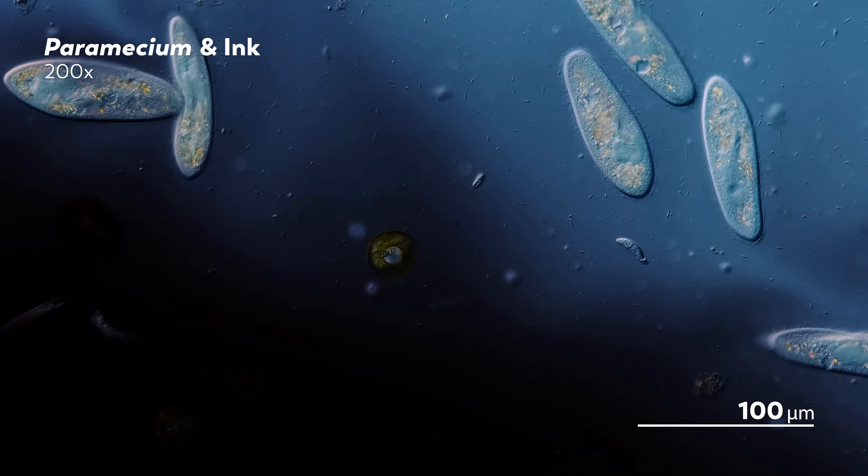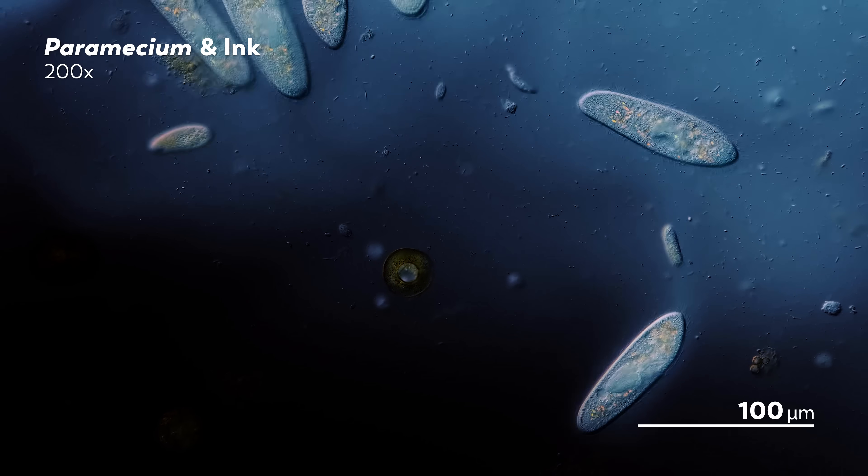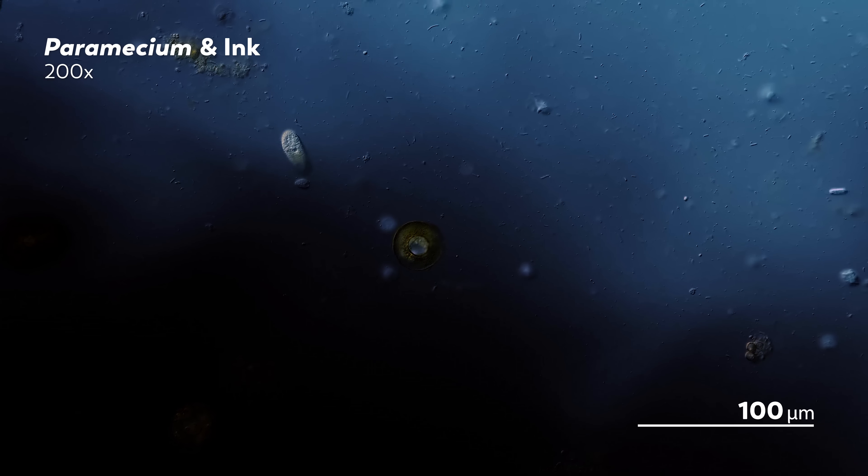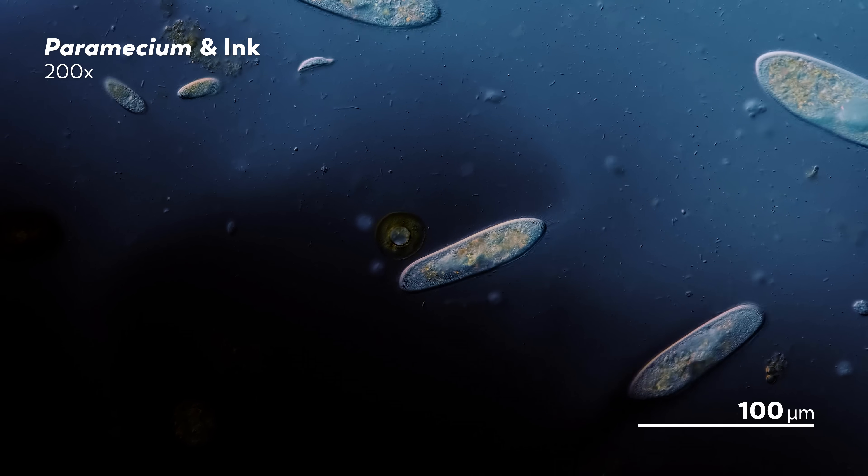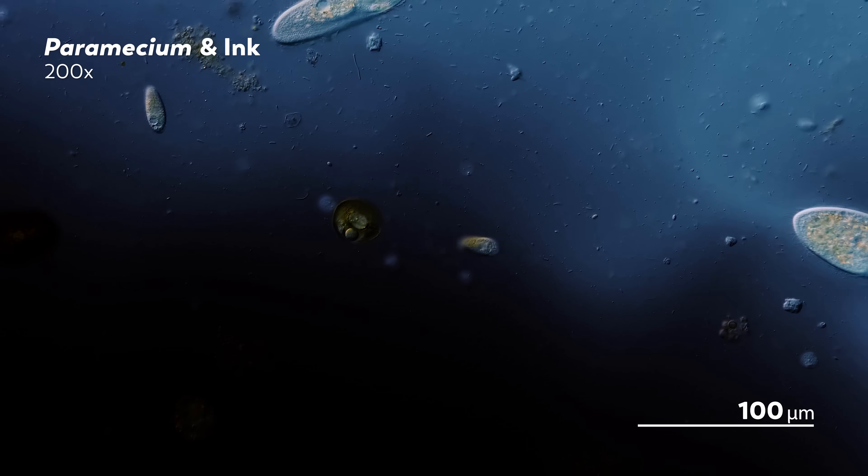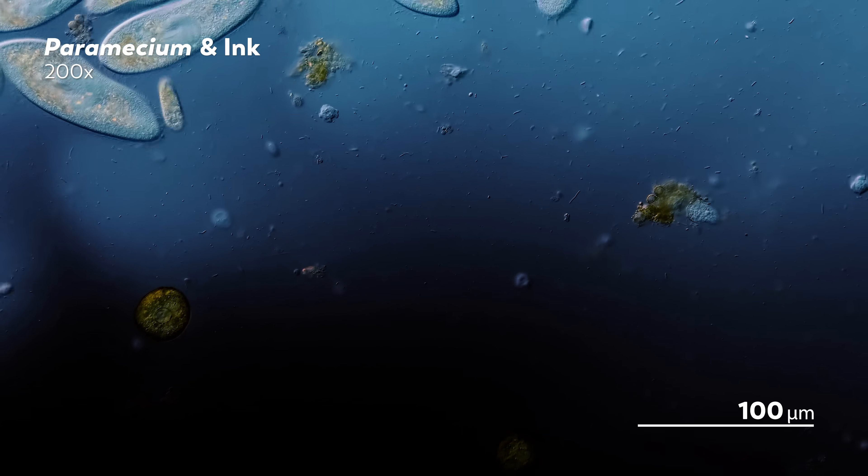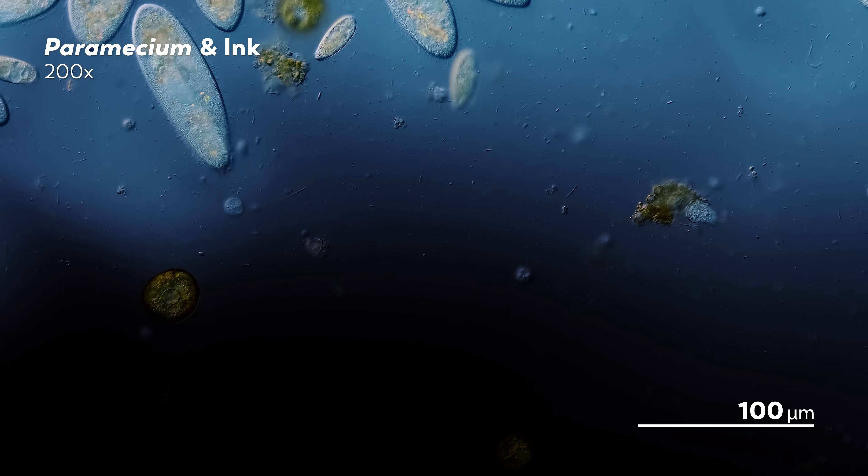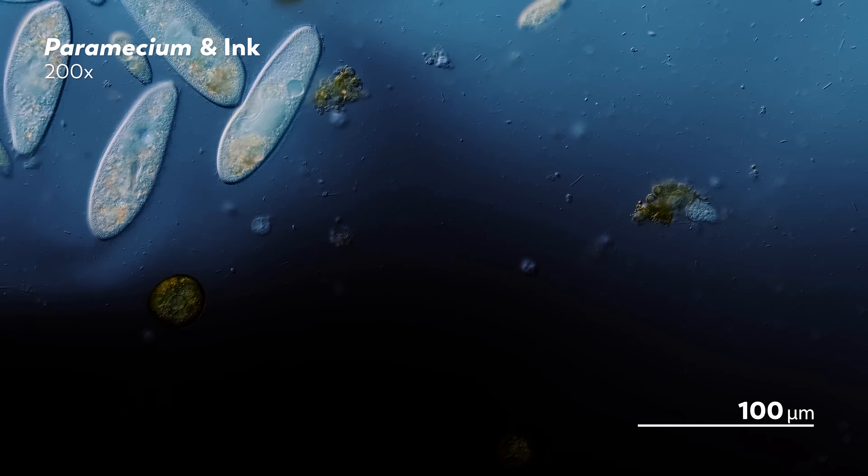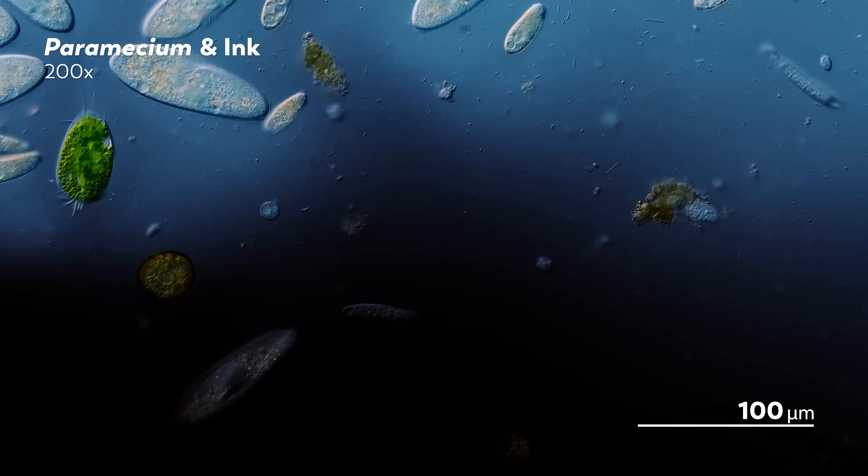Take this slide, for example. It probably looks like James accidentally spilled some ink on the slide, which is in fact almost exactly what happened. There is ink on this slide, but it didn't get there by accident. James added it on purpose. As different parameciums swim in and alongside the ink, you can see the trails they leave behind, a record of the paths they took along the slide.